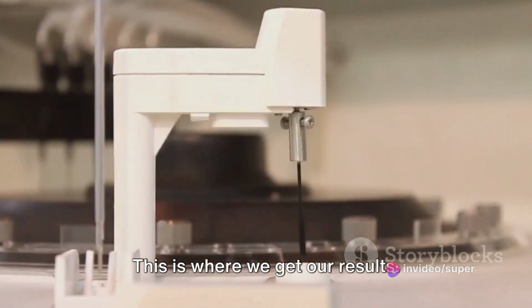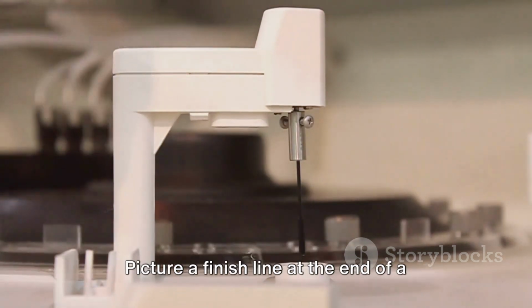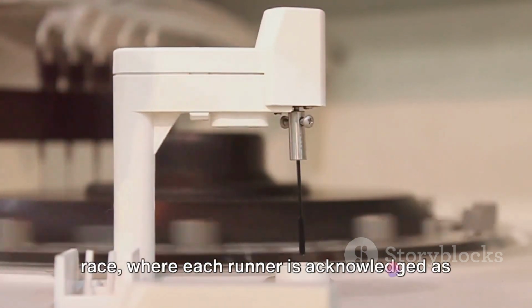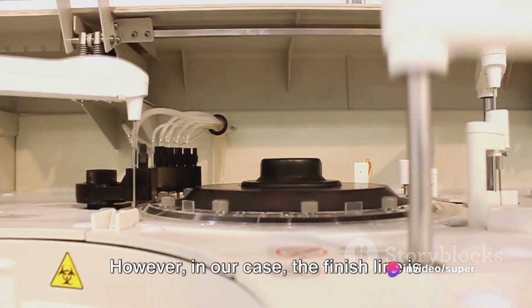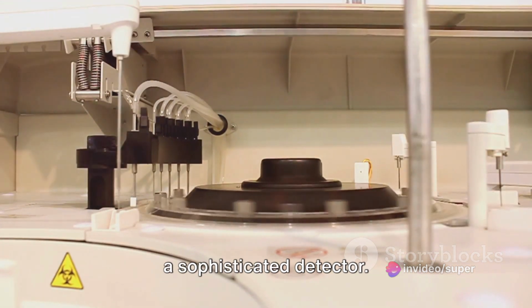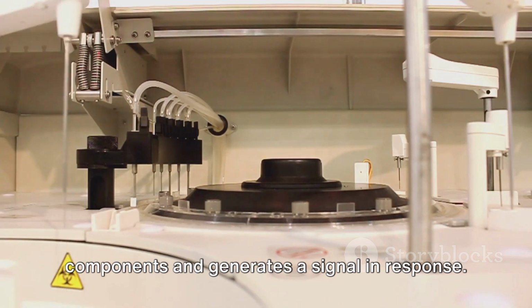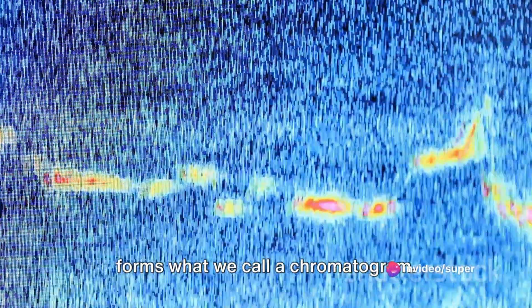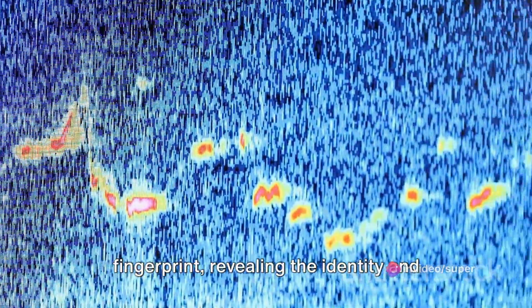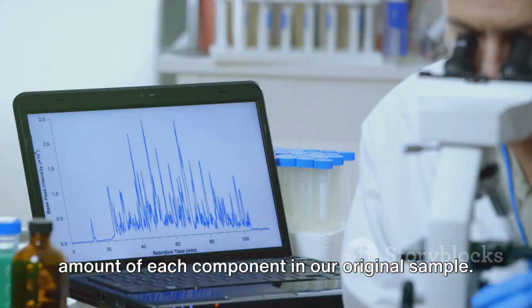Finally, we come to the detection. This is where we get our results. As the separated molecules emerge from the column, they are detected. Picture a finish line at the end of a race, where each runner is acknowledged as they cross. However, in our case, the finish line is a sophisticated detector. This detector senses the individual components and generates a signal in response. The signal, when plotted as a graph, forms what we call a chromatogram. This chromatogram is like a molecular fingerprint, revealing the identity and amount of each component in our original sample.